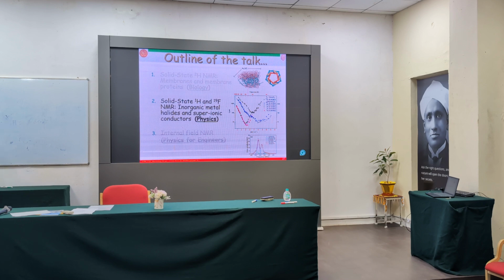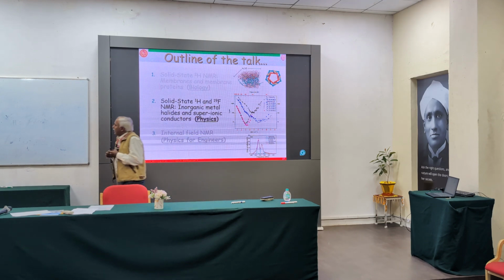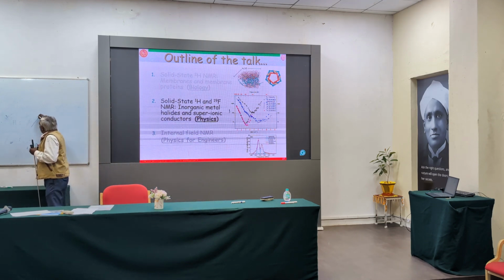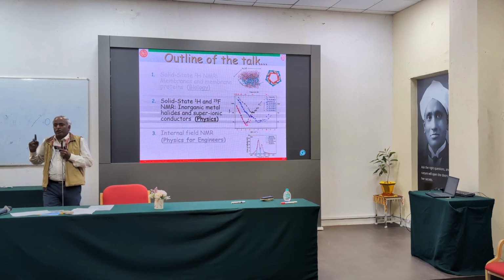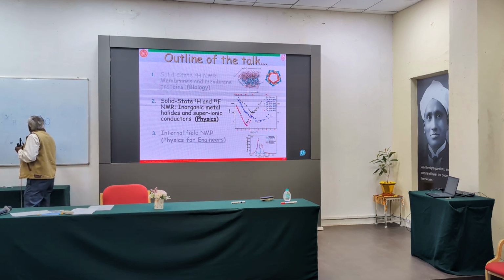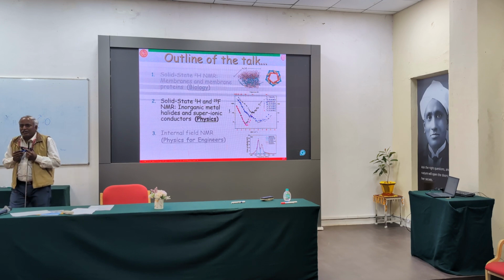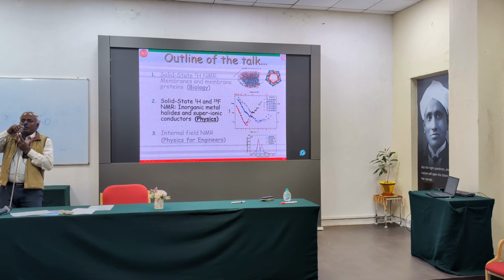This term will be there in one of the interaction Hamiltonian terms. They try to make this go to 0, and if you substitute, you can calculate for what value of theta that shall become 0. That becomes about 54 degrees. I don't remember now the exact number. At that point, instead of keeping your sample this way, they tilt it at that angle. Then they make it rotate.